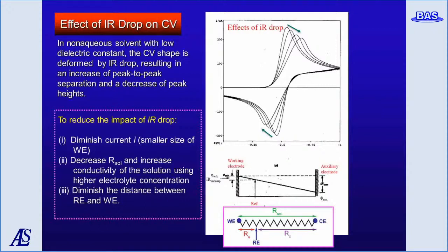The potential that the instrument recorded may not be the potential applied to the analyte in the solution due to the uncompensated resistance Ru.